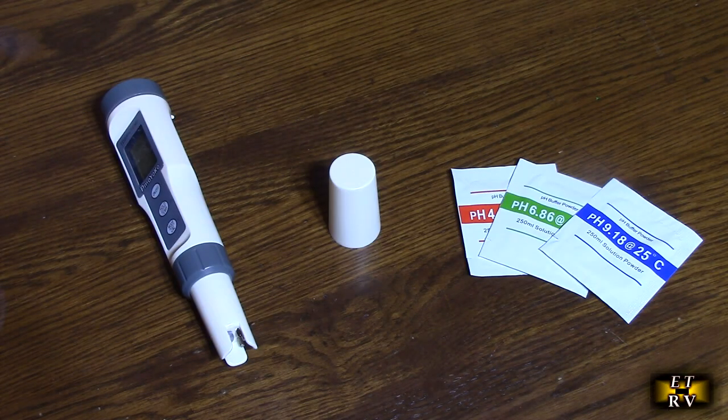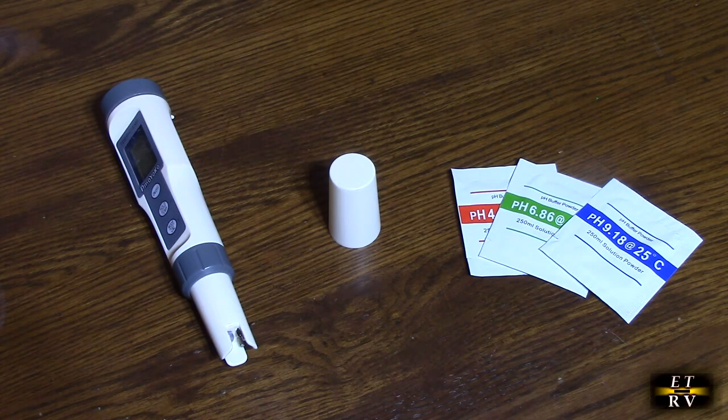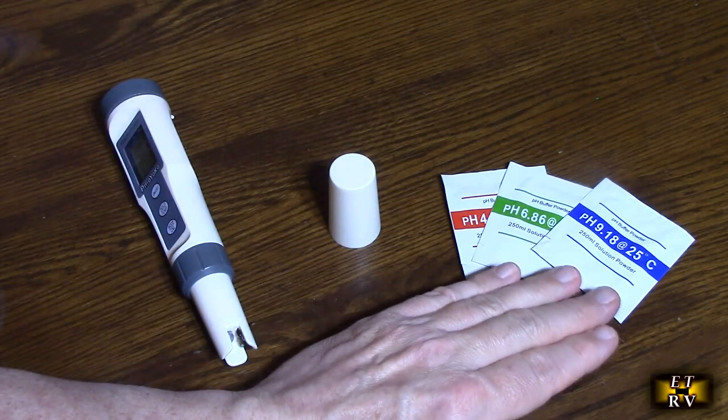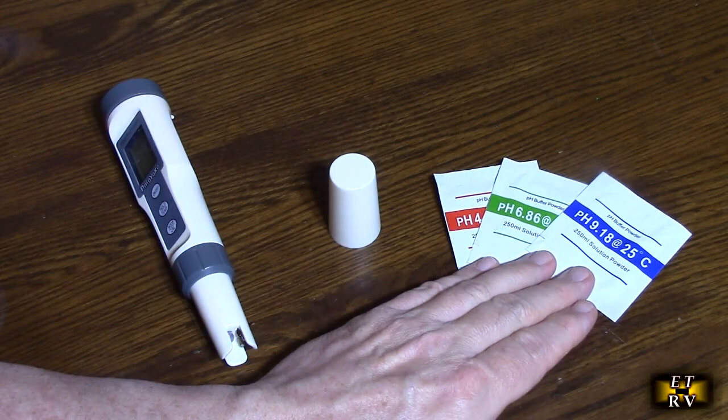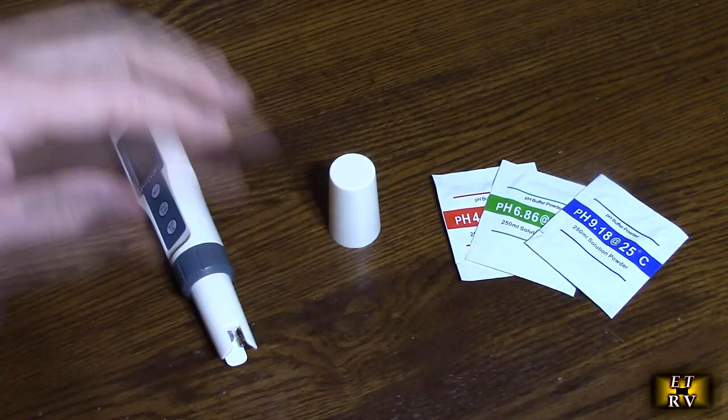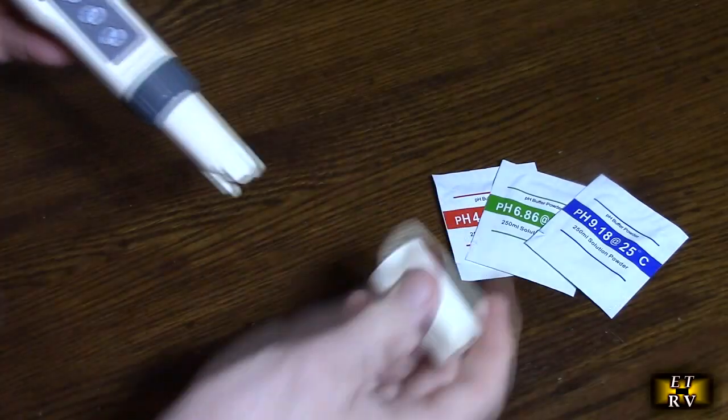It comes in a nice instruction booklet letting you know how to use the unit. These little packets allow you to put them in a fixed amount of water and you can calibrate the pH. If you want to be extremely accurate, you can do that. But it comes accurate right out of the box.